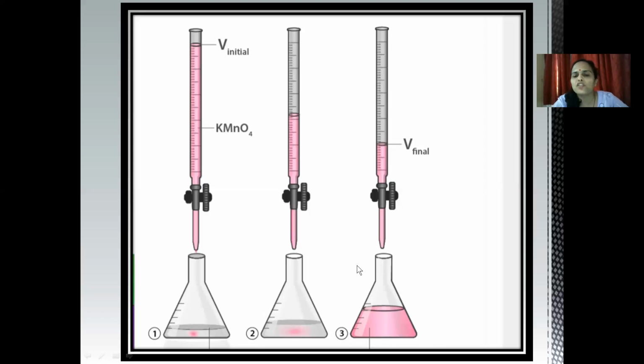So this is the experiment you will be doing in hot condition. Oxalic acid titrations are to be done in hot condition. This is a redox titration. Titration is to find out the strength of an unknown solution. So the unknown solution that is provided to you here is KMnO4 solution, and the known solution is that of oxalic acid. Its concentration is known to us, it is about M/50. So we'll start with the titration and we'll take 3 observations there.